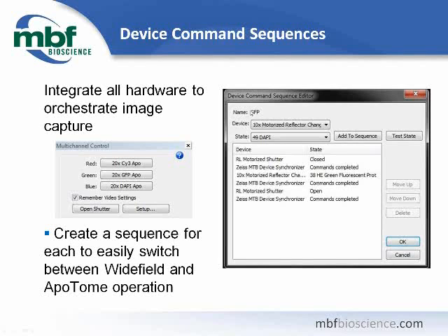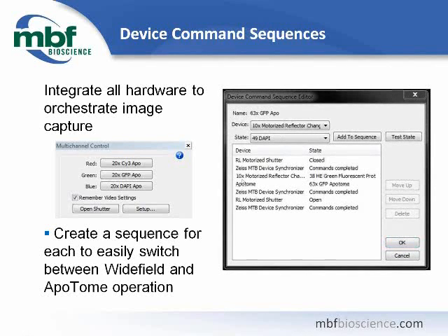A wide field device command sequence for the Zeiss should look like this: we request the motorized shutter be closed, the filter position in the turret is moved to the GFP cube, then we ask for the shutter to open. Synchronizer steps ensure communication between the microscope and software has completed prior to moving on — especially important at the last step to ensure all commands are done before the camera acquires its image. For an Apatome device command sequence, only one thing changes: we include the Apatome device and select the objective-filter calibration we set up in the Apatome setup dialog.